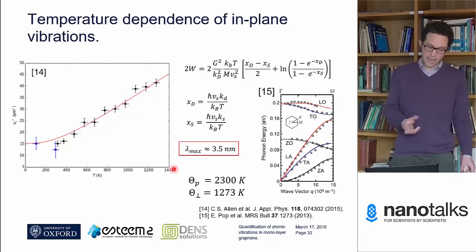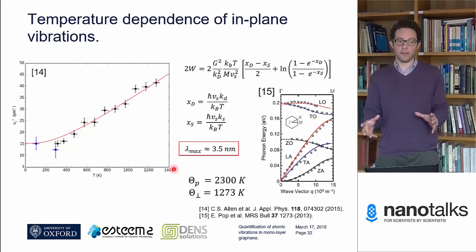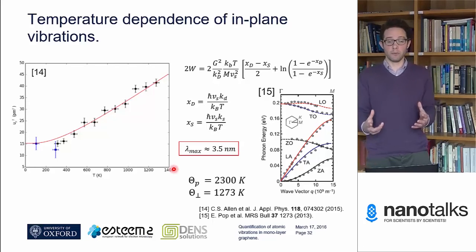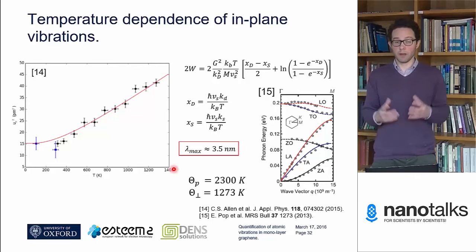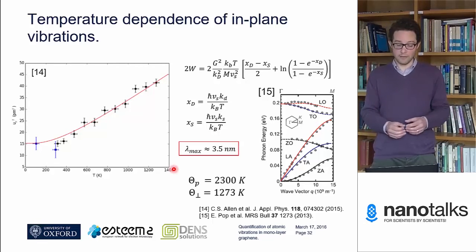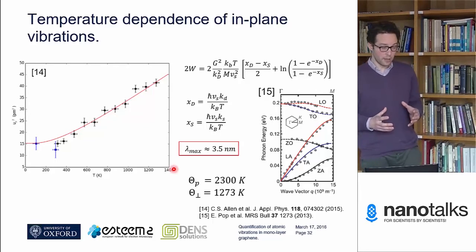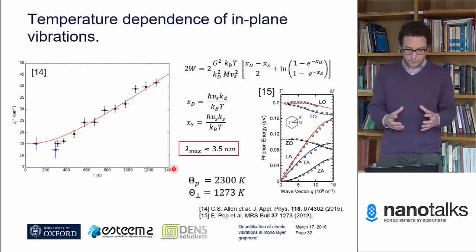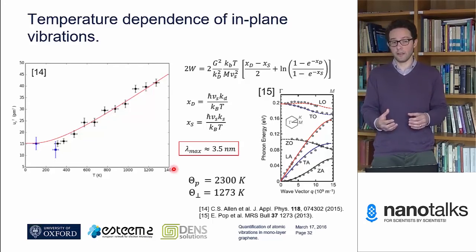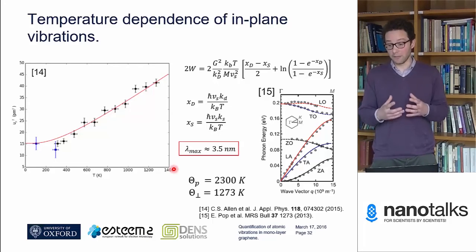So one might expect that there is a physical limit on the maximum phonon wavelength that a crystal can support, and this may well be determined by, for example, the crystallite size, or something to do with defect density. Our samples, we know from room temperature TEM studies, have a very, very low defect density.